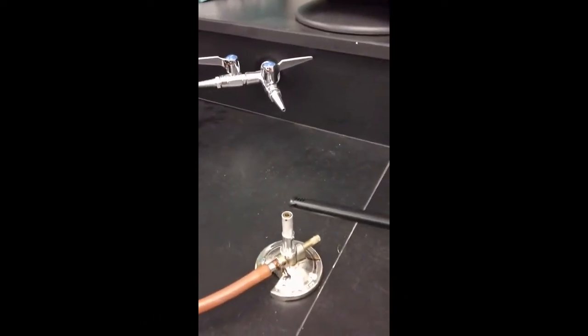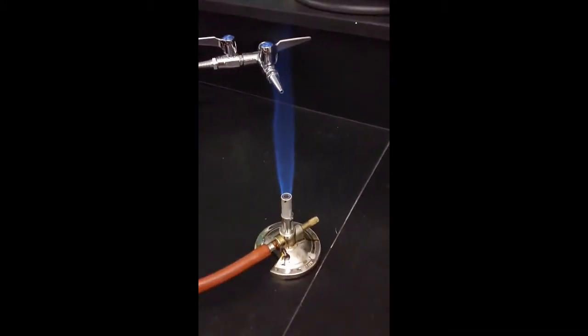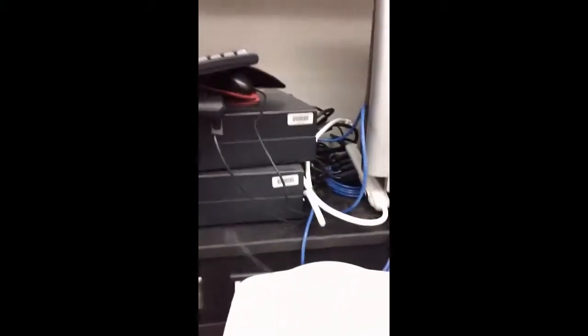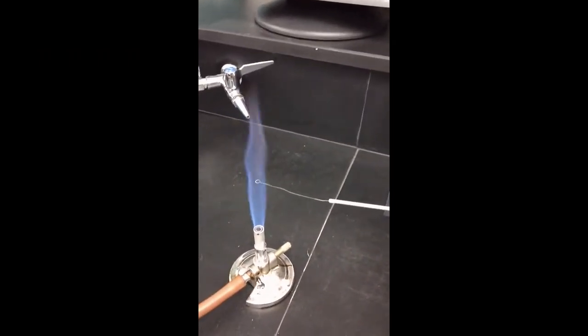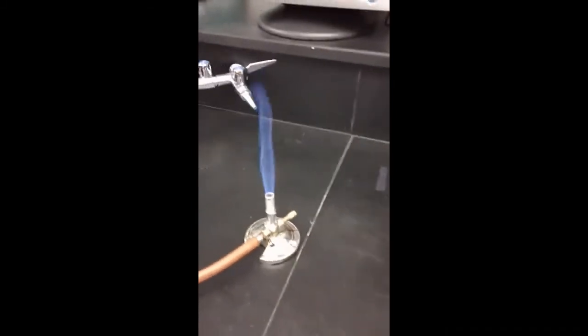I'm going to go ahead and light. Okay, so there I have it lit. Now I need to make sure that my flame test rod is clean. I'm going to put it there and make sure it doesn't burn any colors. Alright, so now is when you're going to want to make very sure that you're taking detailed observations.